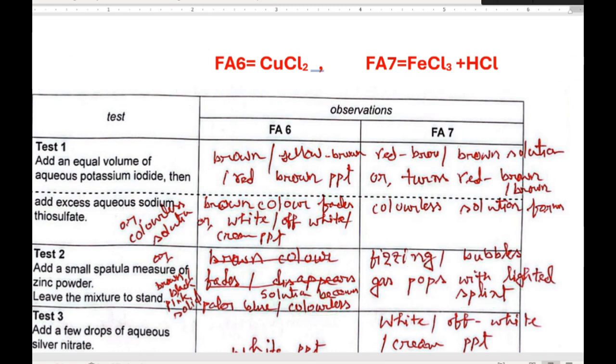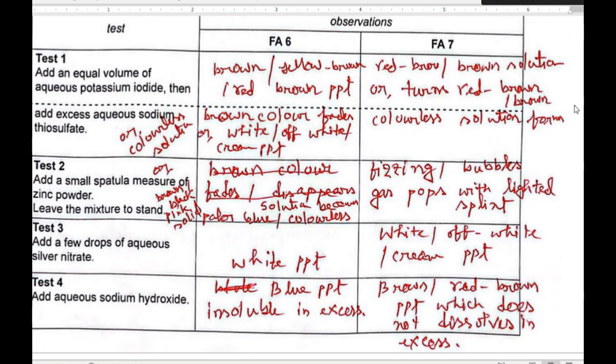Now test 3, add a few drops of aqueous silver nitrate.